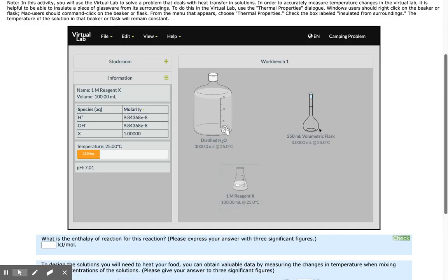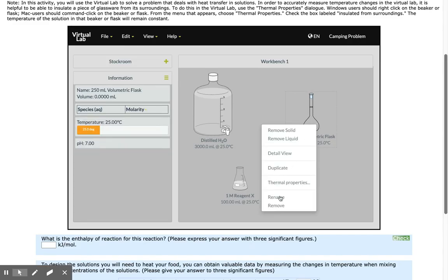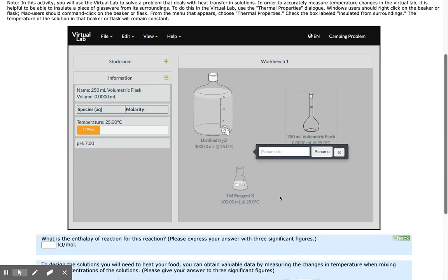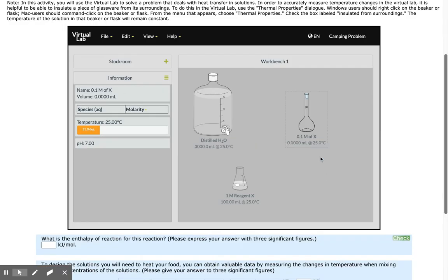Before I begin, I'm going to right click on my volumetric flask and rename it so I can keep track of what solution I have here. This is a 0.1 molar solution of X. Click rename.